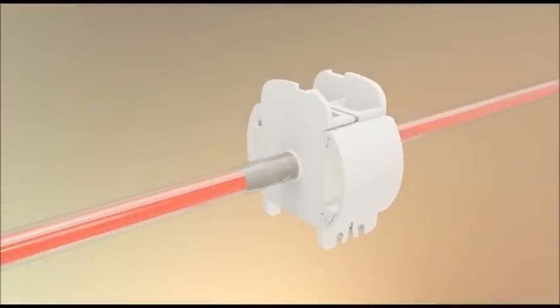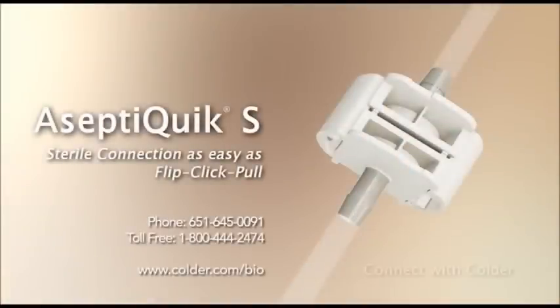You are now ready for small flow sterile fluid transfer. Please contact your Colder Products representative for additional information on the benefits of the AseptiQuik S Sterile Connector.